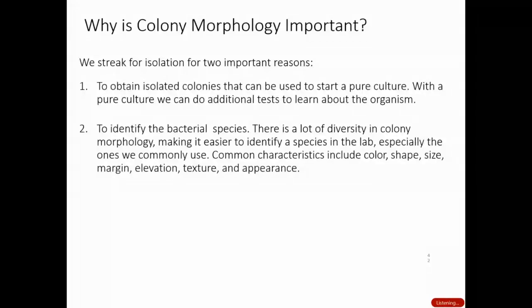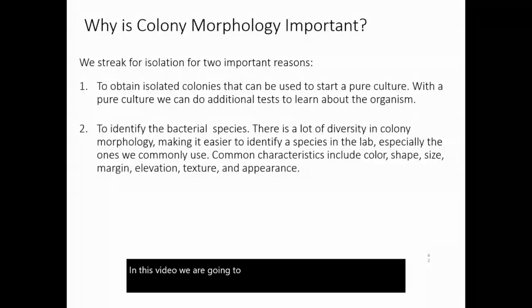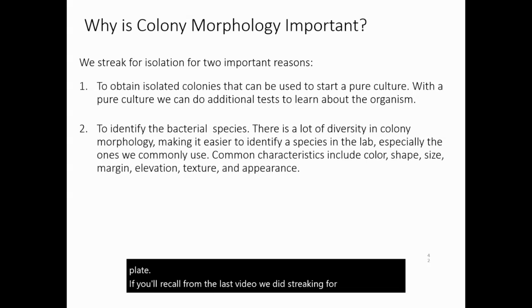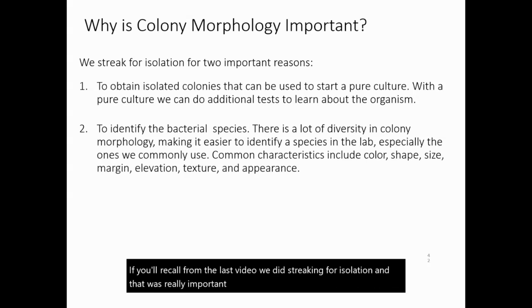In this video, we are going to talk about colony morphology. And basically what that means is we are going to talk about different ways that we can describe and classify colonies that grow on an agar plate. So if you'll recall from the last video, we did streaking for isolation.